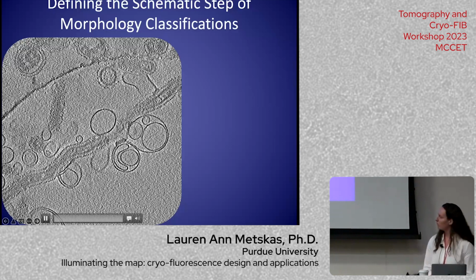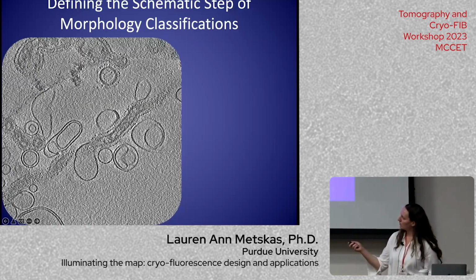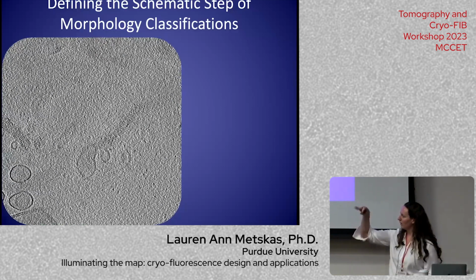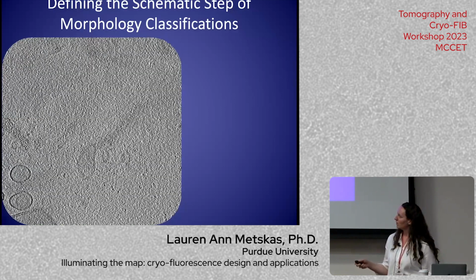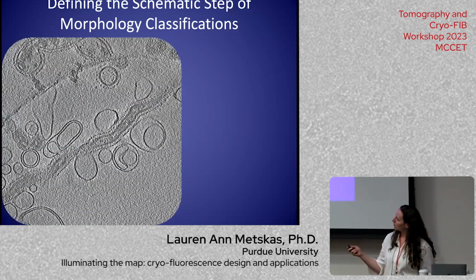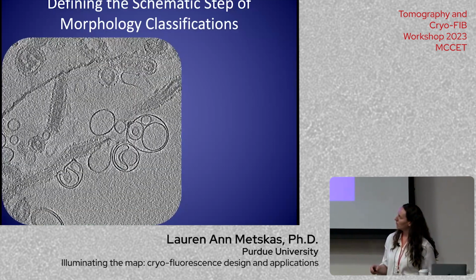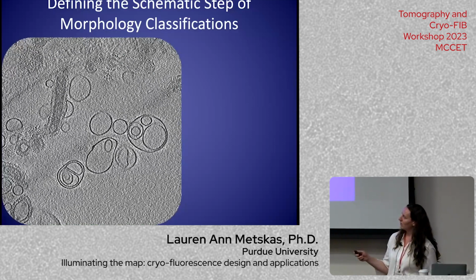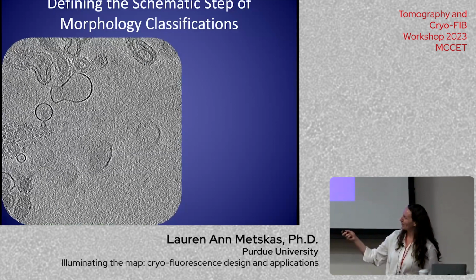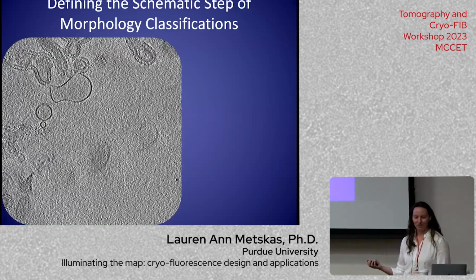All right. So there's a nice extended interface right there. And it's going to come back around. And there's going to be a really nice pinching interaction up in this region coming up. And for everybody who's learning how to do this on a Krios, I did this with a side entry holder, so you can do tomography with lesser microscopes. There's your pinch right there. All right, so what of that is functional?